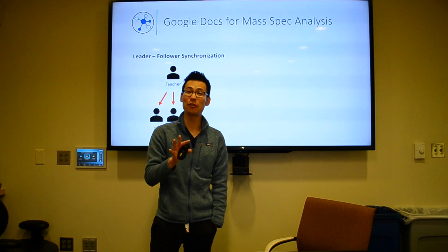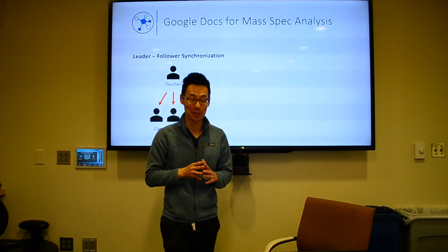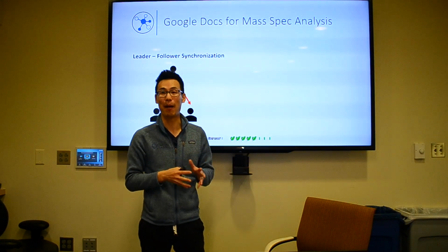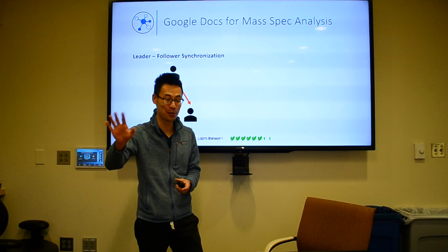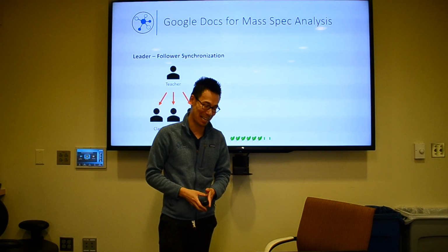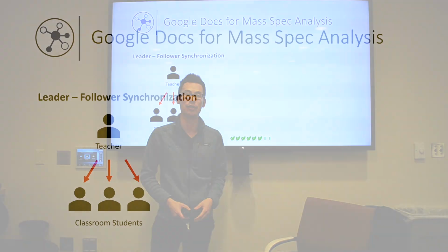And so one of the cooler things that we wanted to show off is the synchronous communication. The way we tell others, it's called Google Docs, but for mass spec inspection and data analysis. So this was really, really fun when we first started implementing and thinking about it with Danny. One of the models that we offer is called leader-follower synchronization.